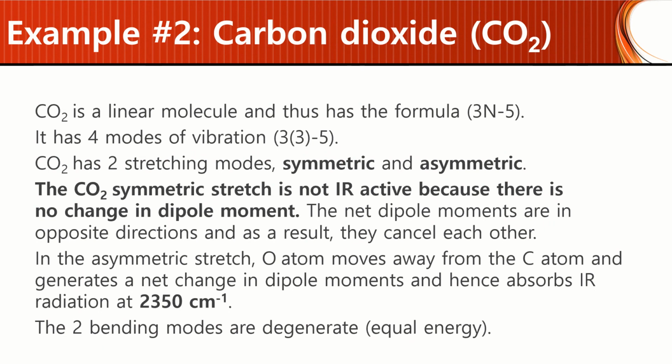However, the symmetric stretch is not IR active because there's no change in dipole moment. The net dipole moments are in opposite directions, and as a result they cancel each other. In the asymmetric stretch, the oxygen atom moves away from the carbon atom, which generates that net change in dipole moment and hence absorbs IR radiation at 2350 wave numbers.